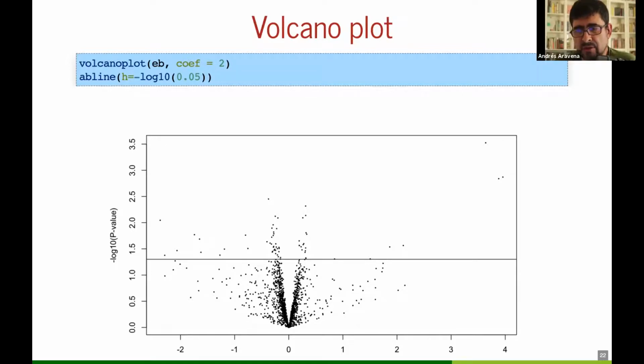A very good question. To be honest, I always do this with the adjusted p-value. Well, there is a question of how you adjust them. There are a couple of strategies, but in general, I go with the adjusted p-value.